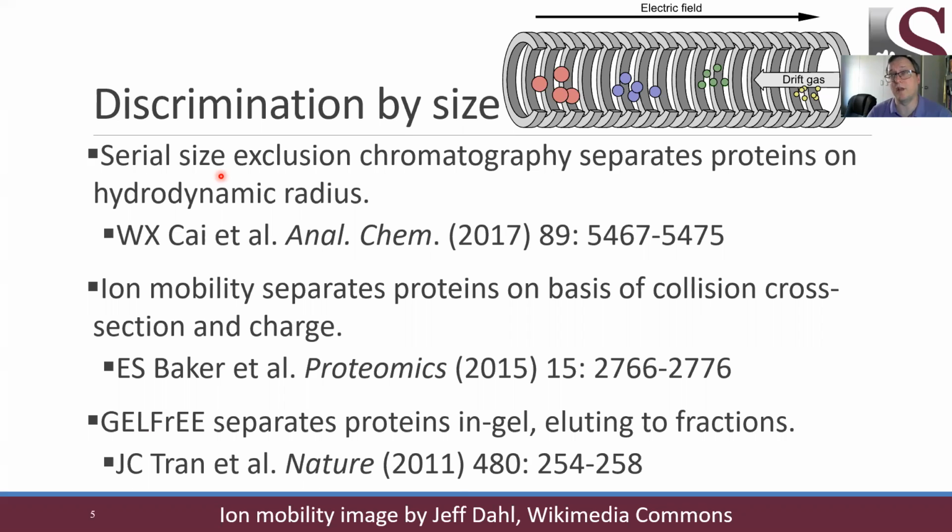The company that really staked its flag in the turf first in the space of ion mobility was Waters. But these days, there are a lot of different mass specs being sold with ion mobility sources on them. I would note that timsTOFs from the company Bruker have become very popular in the proteomics community, and I know that Agilent, for example, has ion mobility.